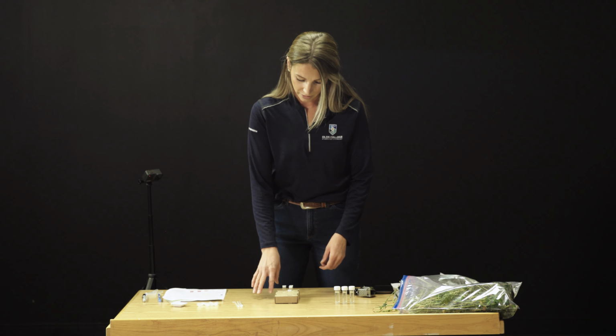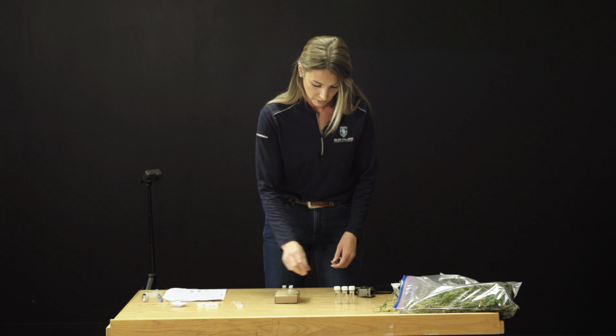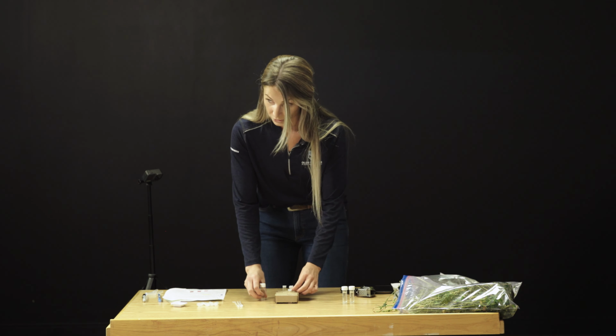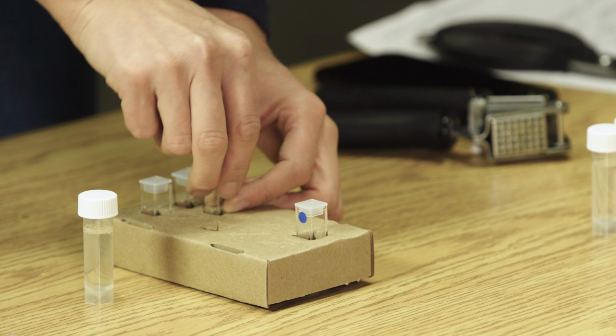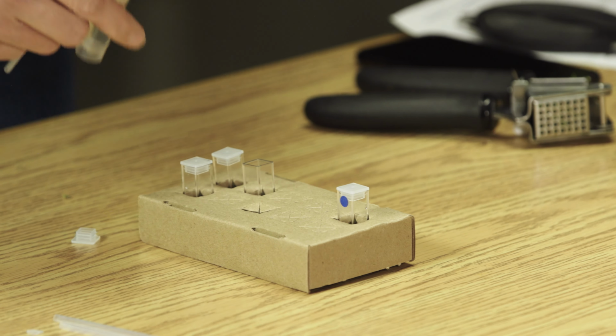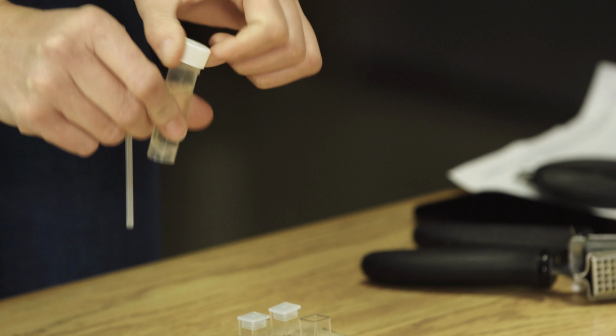For step 3, we will have to do this within 5 minutes. You will take the samples that we prepared and add 1 drop from the surface of each into each cuvette using the pipette.